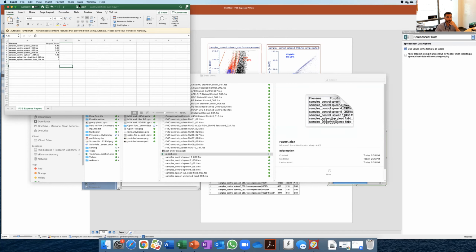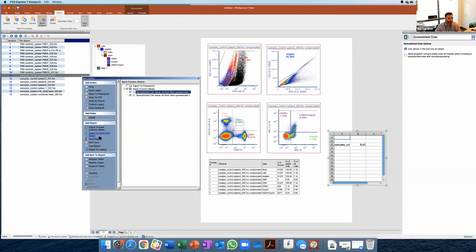And actually, this is an Excel file, but you could export it to a CSV if I'm not mistaken. Right, no, in this case, it's only an Excel file, but you could export that into a CSV file and use R to do statistics on it or anything else.